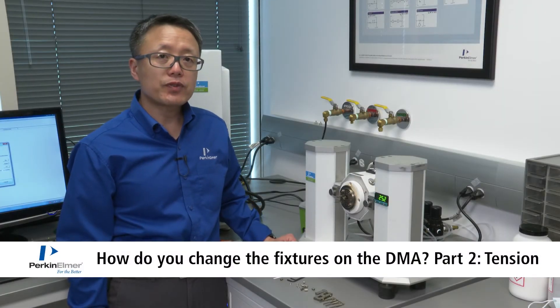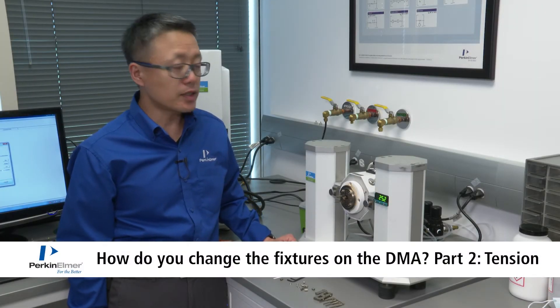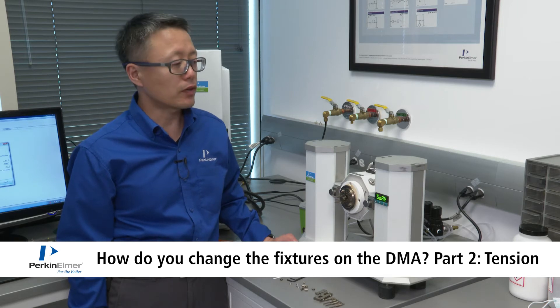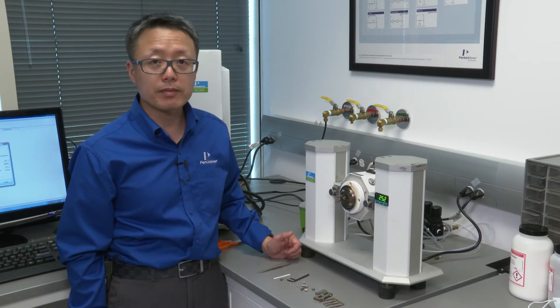Now we're setting up the fixtures for tension mode. Tension is best for softer samples or thin films or fiber samples.